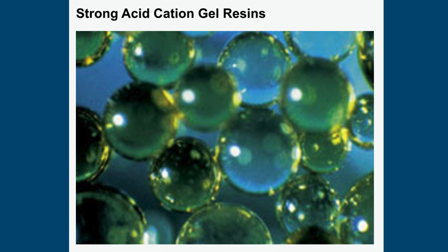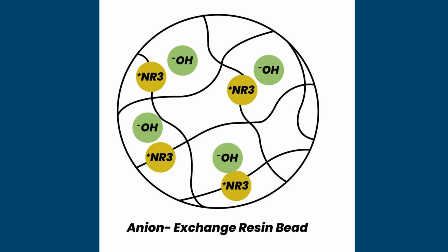This relationship is particularly important in chromatographic separations because analytes must diffuse into accessible exchange sites rather than merely interact with the external bead surface.